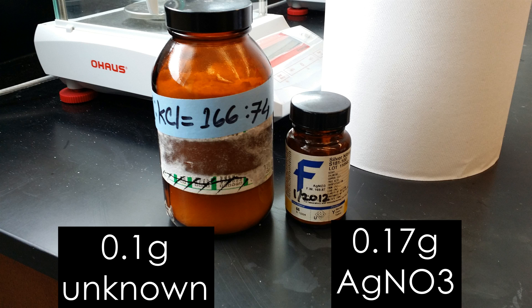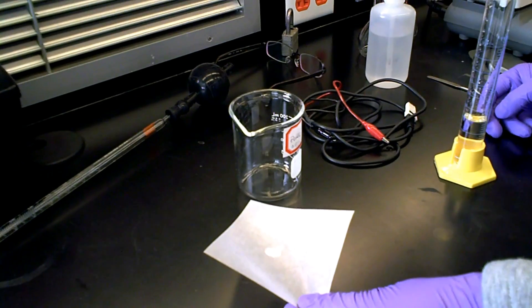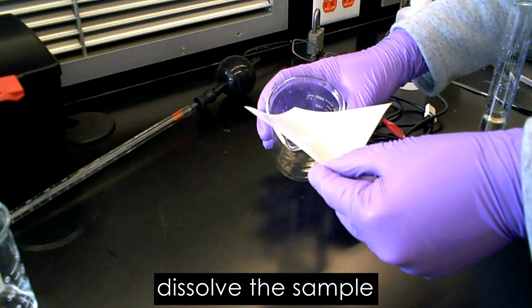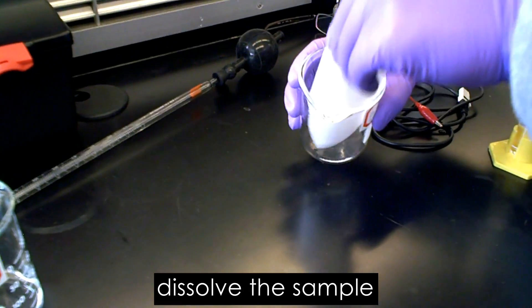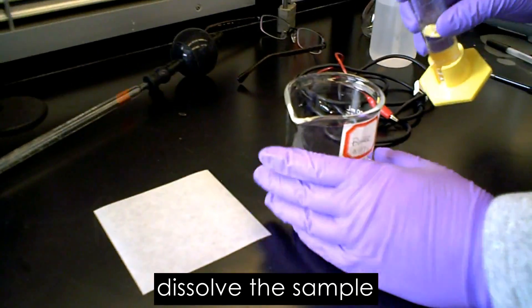First, you will need to weigh 0.1 grams of unknown mixture of potassium iodide and potassium chloride, and then 0.17 grams of silver nitrate. Then you will dissolve the unknown mixture into a 250 milliliter beaker and dissolve with 20 milliliters of distilled water.